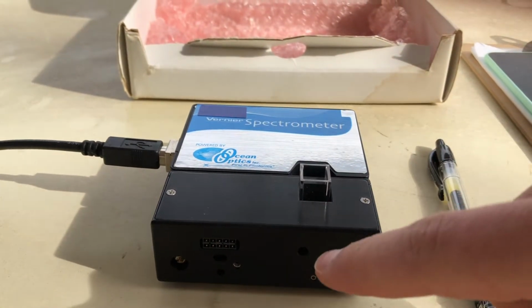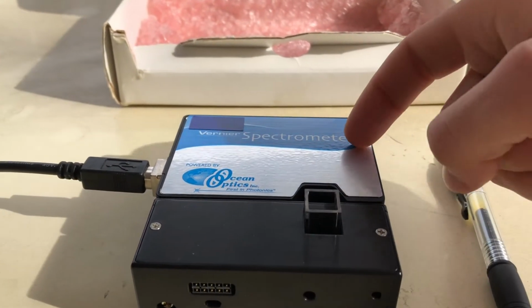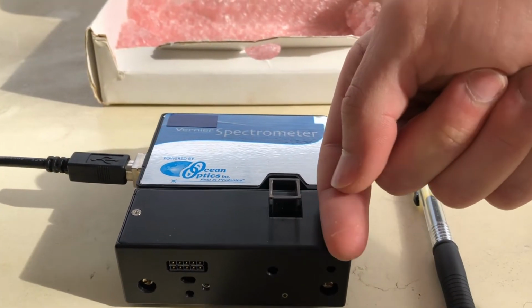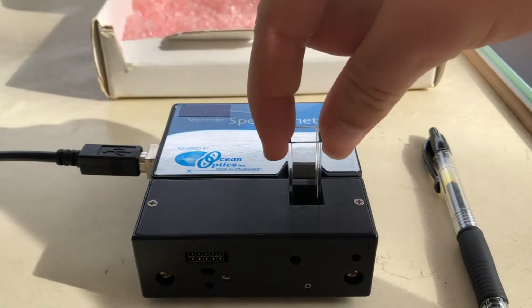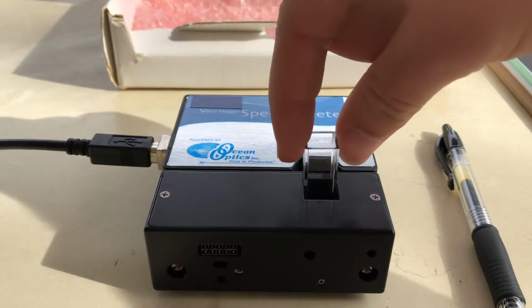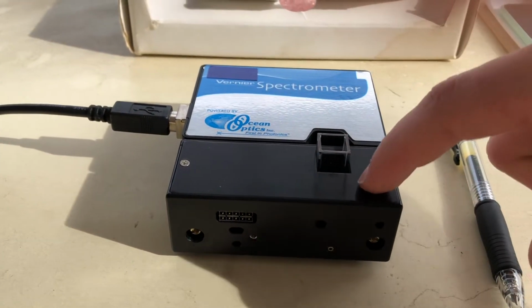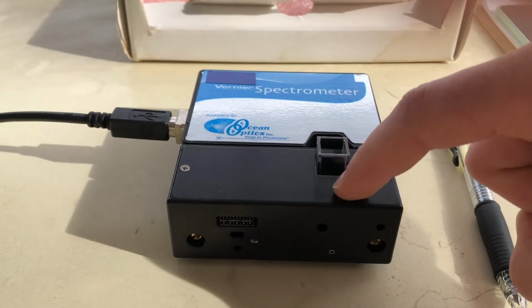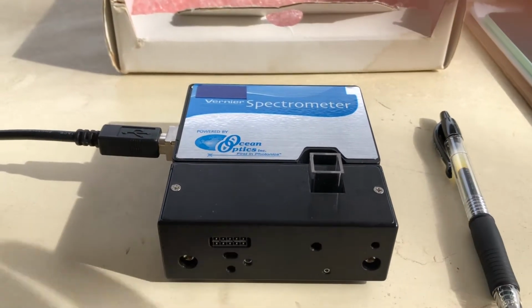And on the other side, over here, there's a receiver that picks up a signal based on the amount of light that actually makes it through the solution. So you could imagine that if I was filling this cuvette here with a sample of just tap water, most of the light would make it through. So the receiver over here would pick up that most of the light made it through, and it would give you an absorbency or an intensity value based on that, and based on what you told the computer to register for.